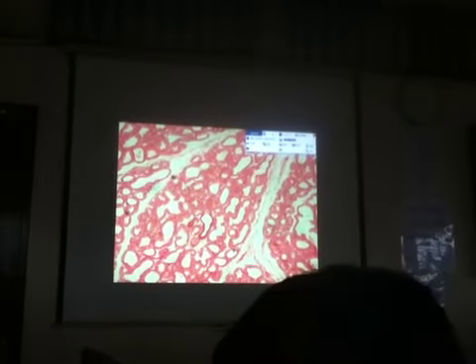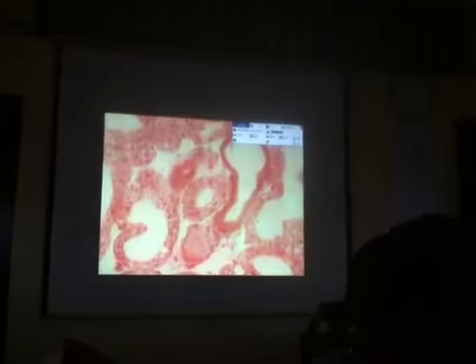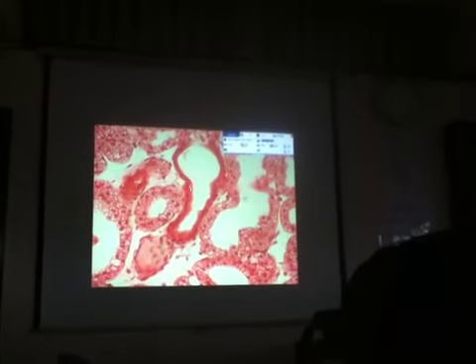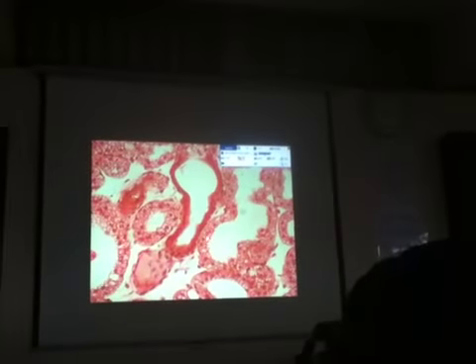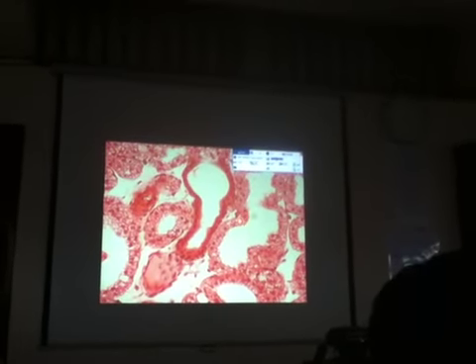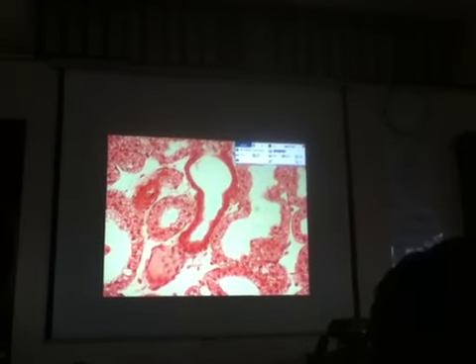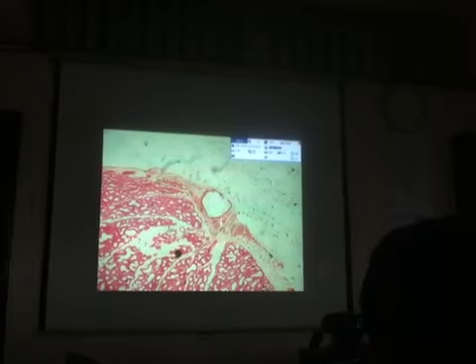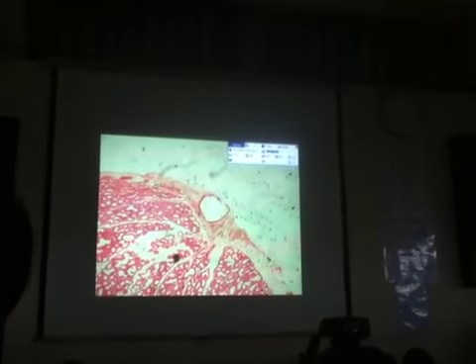What type of epithelium is lining the acini? Simple cuboidal. Notice how low the epithelial cells of the duct are as compared to the epithelial cells lining the acinus. That is an intralobular duct. And the ducts which are outside of the lobule, such as that duct, are called interlobular. Okay, so that should be it for this slide discussion. You may now borrow your microscopes.